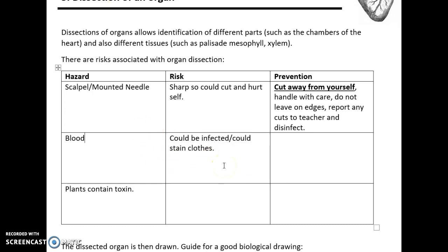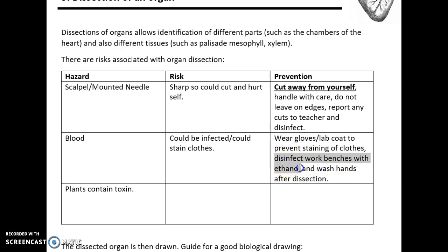Blood - the risk is that blood could be infected and could cause staining. In order to prevent that, you should wear gloves and a lab coat to prevent staining clothes, and also disinfect workbenches with ethanol to prevent the spread of infection and bacteria.